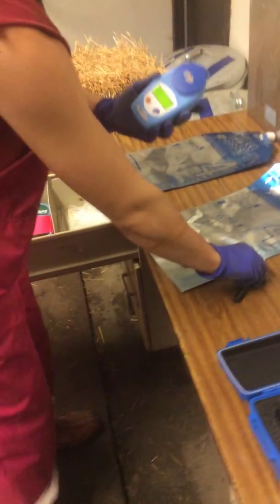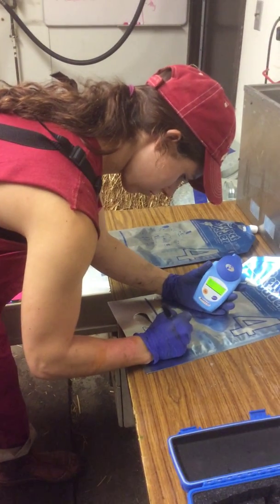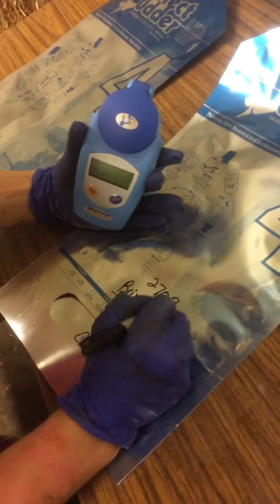It will record the sugar level inside the colostrum — as you can see here it's 27.2%. The bag is then labeled with the BRICS reading as well as the cow number.